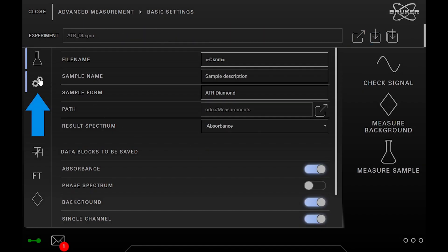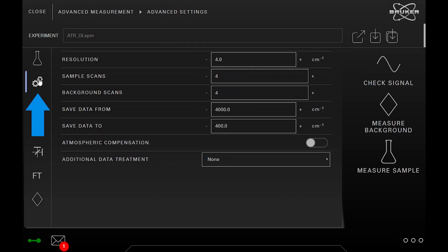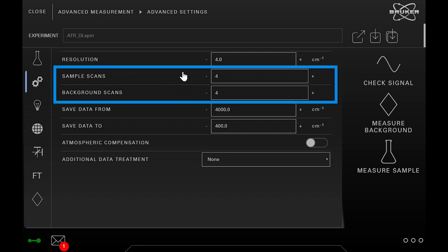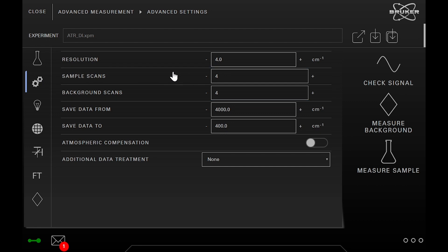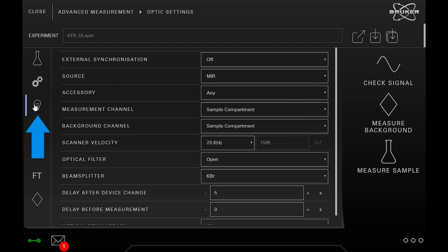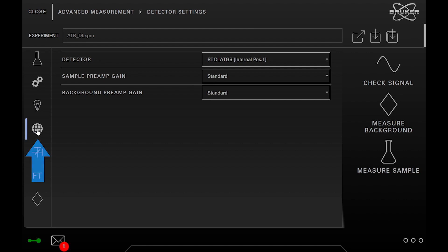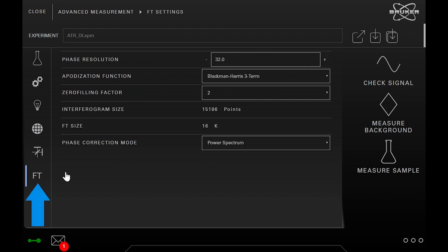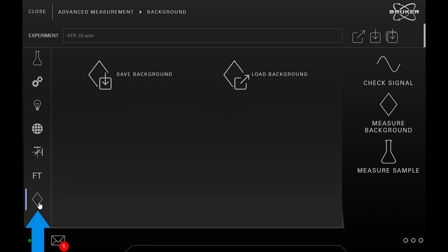We also have the Advanced tab where you can define for instance the spectral resolution or the number of scans. Next are the Optic Parameters, Detector Settings, Acquisition Parameters, Fourier Transform Settings and a tab for Background Management.